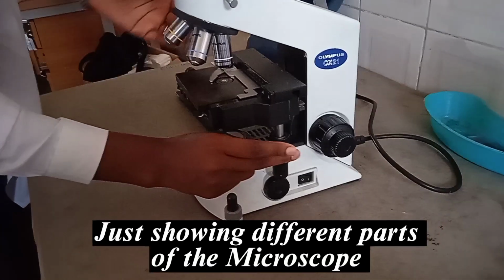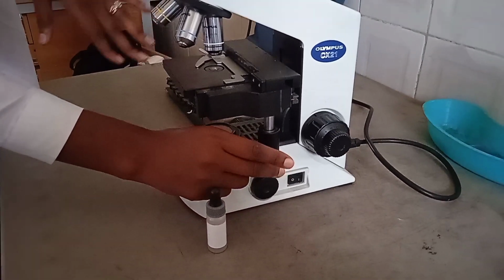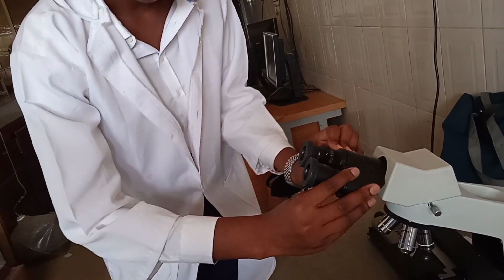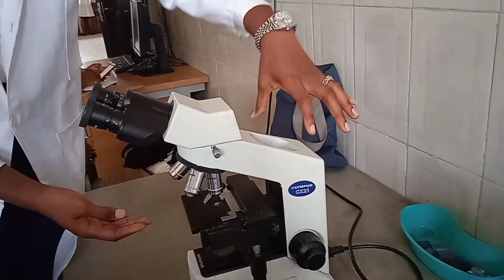Stage adjuster. This one is to move forward and backward. Then this one moves the stage left or right. Inside, this can open up like this. That's the eyepiece. You can open it up like this. That's adjusted very well according to your eye, or you can also bring it down. So this is the arm, and when you're carrying the microscope, you have to carry it by the arm.